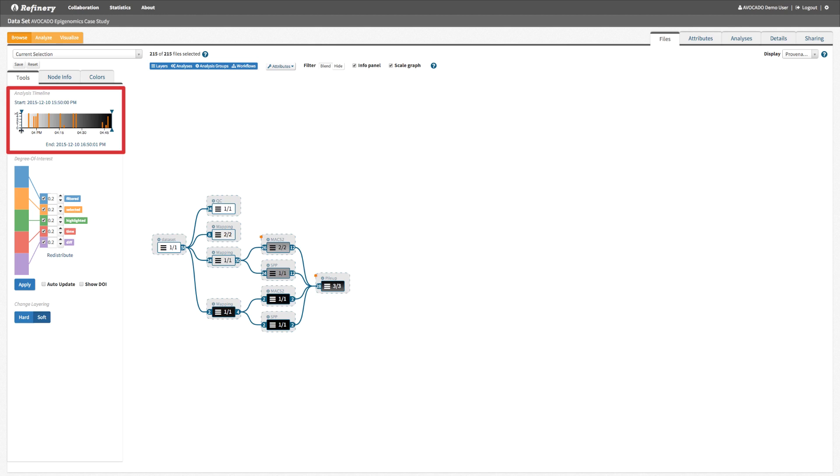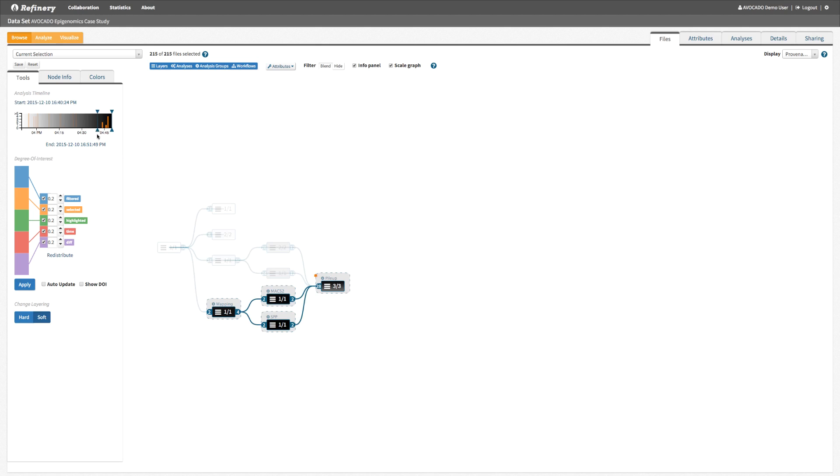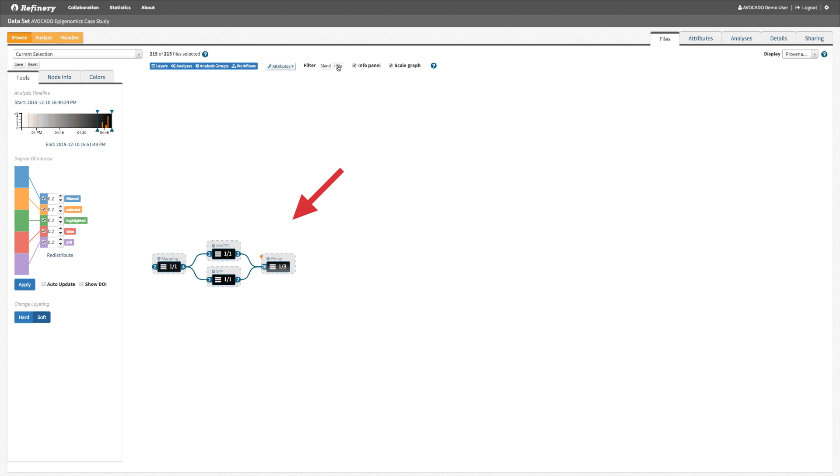We can also filter nodes based on these attributes and either fade filtered nodes or temporarily remove them from the graph.